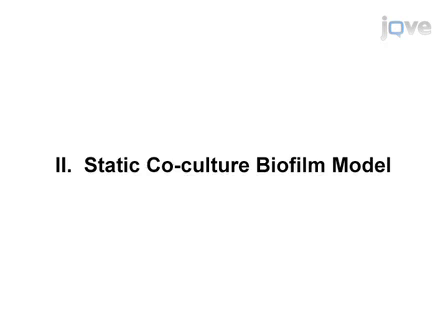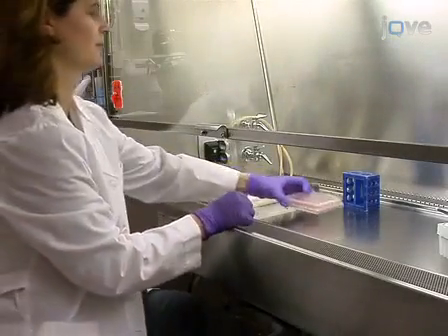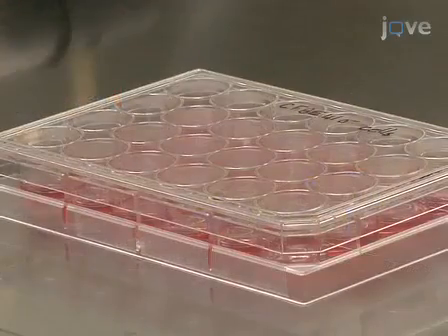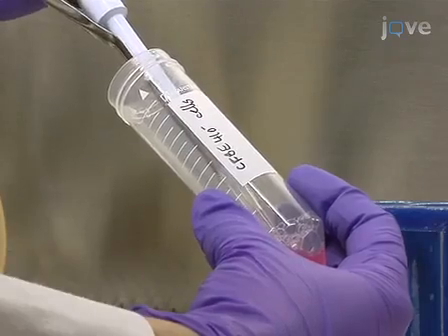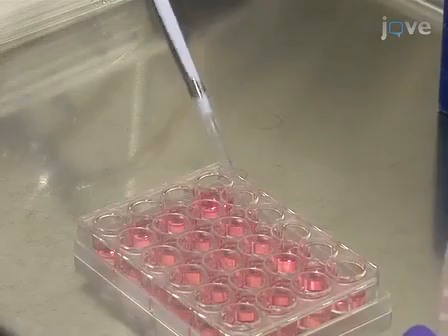The static co-culture biofilm model uses CFBE cells, which are immortalized human airway epithelial cells originally developed from an individual with cystic fibrosis. 7 to 10 days prior to bacterial inoculation, seed the CFBE cells in a 24-well tissue culture plate.